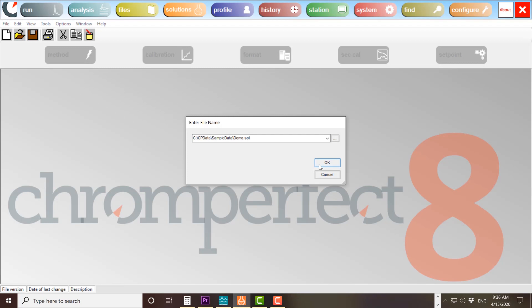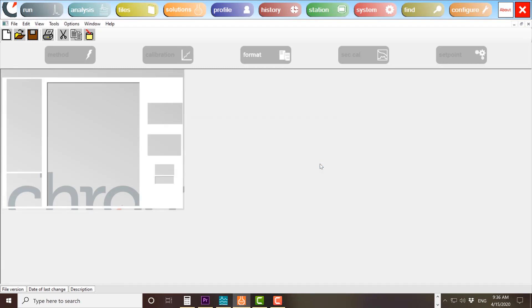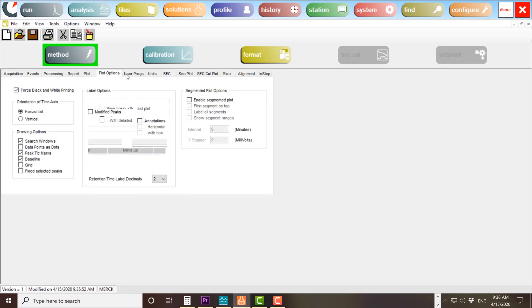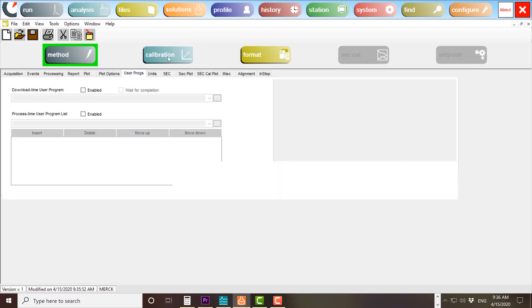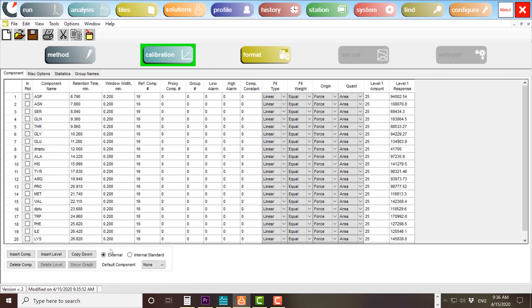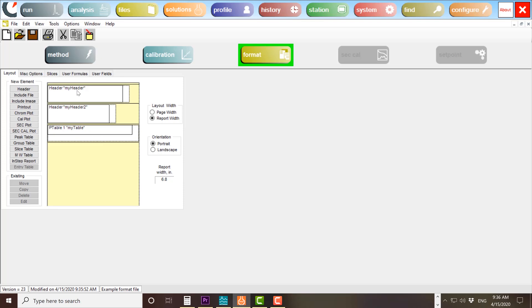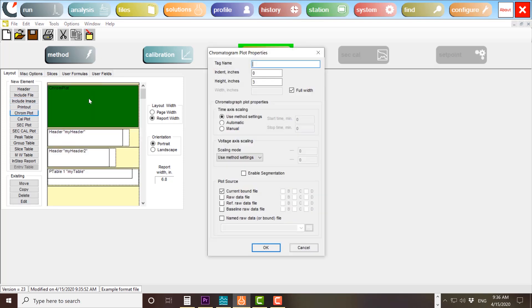New with ChromePerfect version 8, we have introduced solution files. Just like the bound file for data, a solution file is a container for data acquisition and processing. You no longer need a separate method, calibration, and report. It is all contained within a single file.